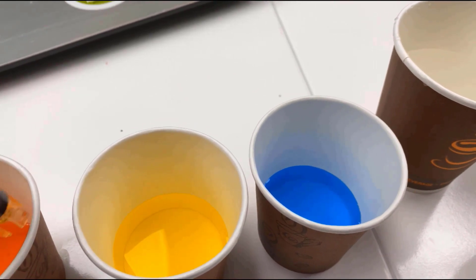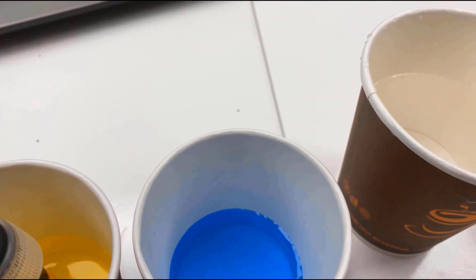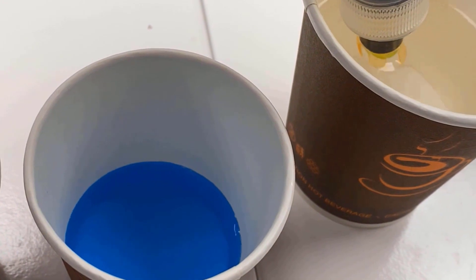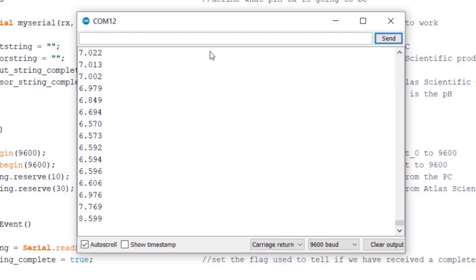Remove the sensor from the pH 4 solution and rinse it with water, then put it into the pH 7 solution. Type 'Cal,mid,7' and hit send — the sensor is now calibrated for pH 7. Repeat this again with the pH 10 solution: remove the sensor, rinse with water, and put it in the pH 10 solution. Type 'Cal,high,10' and hit send — the sensor is now calibrated for pH 10.